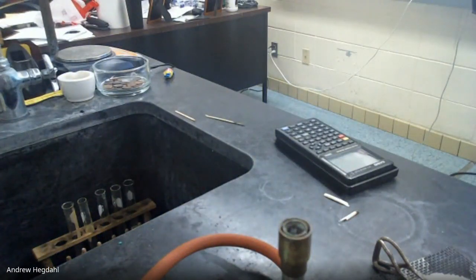So as it looks like you guys are finished describing your salts, I'll start turning off the lights, and you guys can start burning them. And I'll turn off the lights. Yeah, if you don't have a problem working on your own.